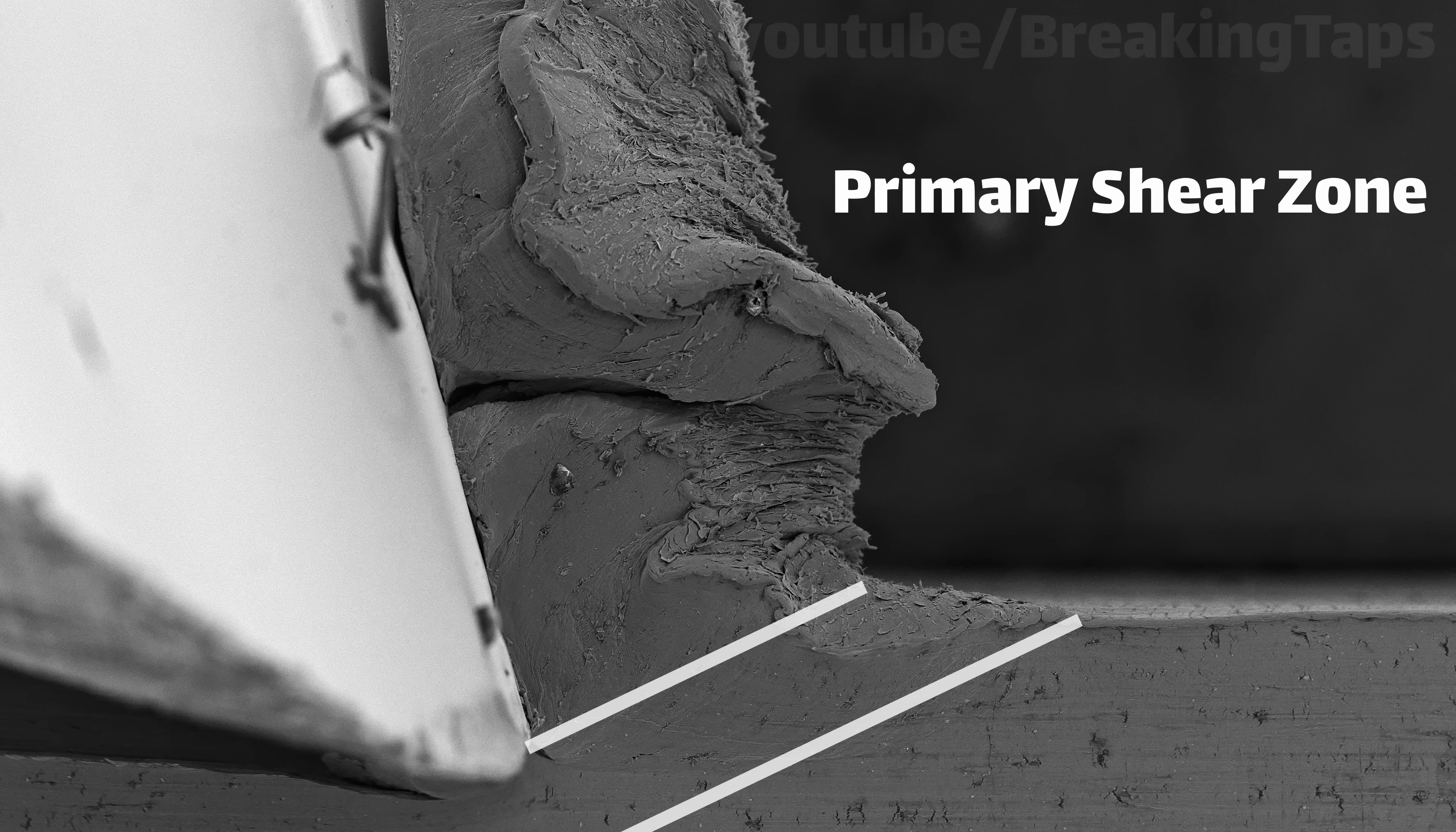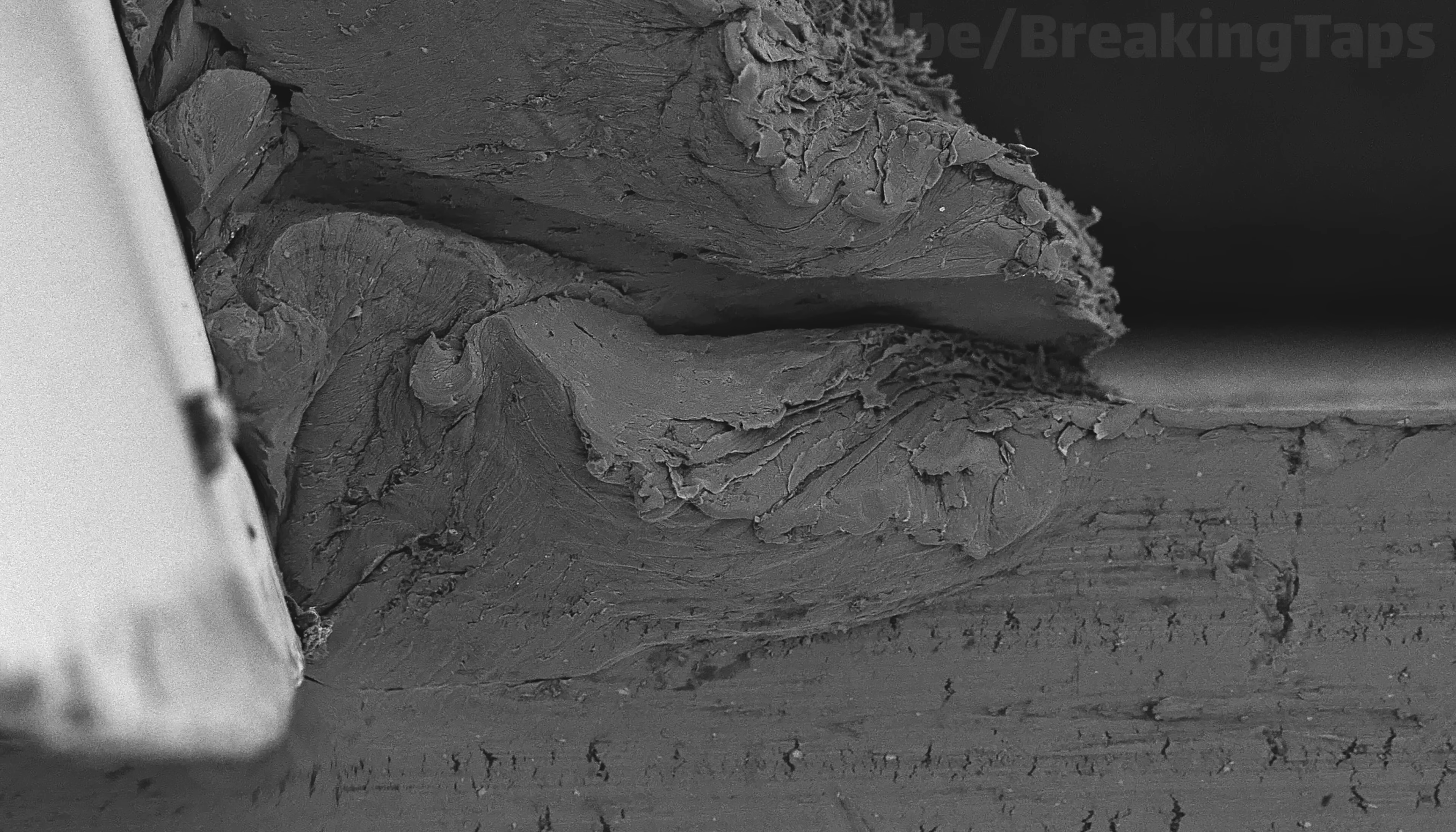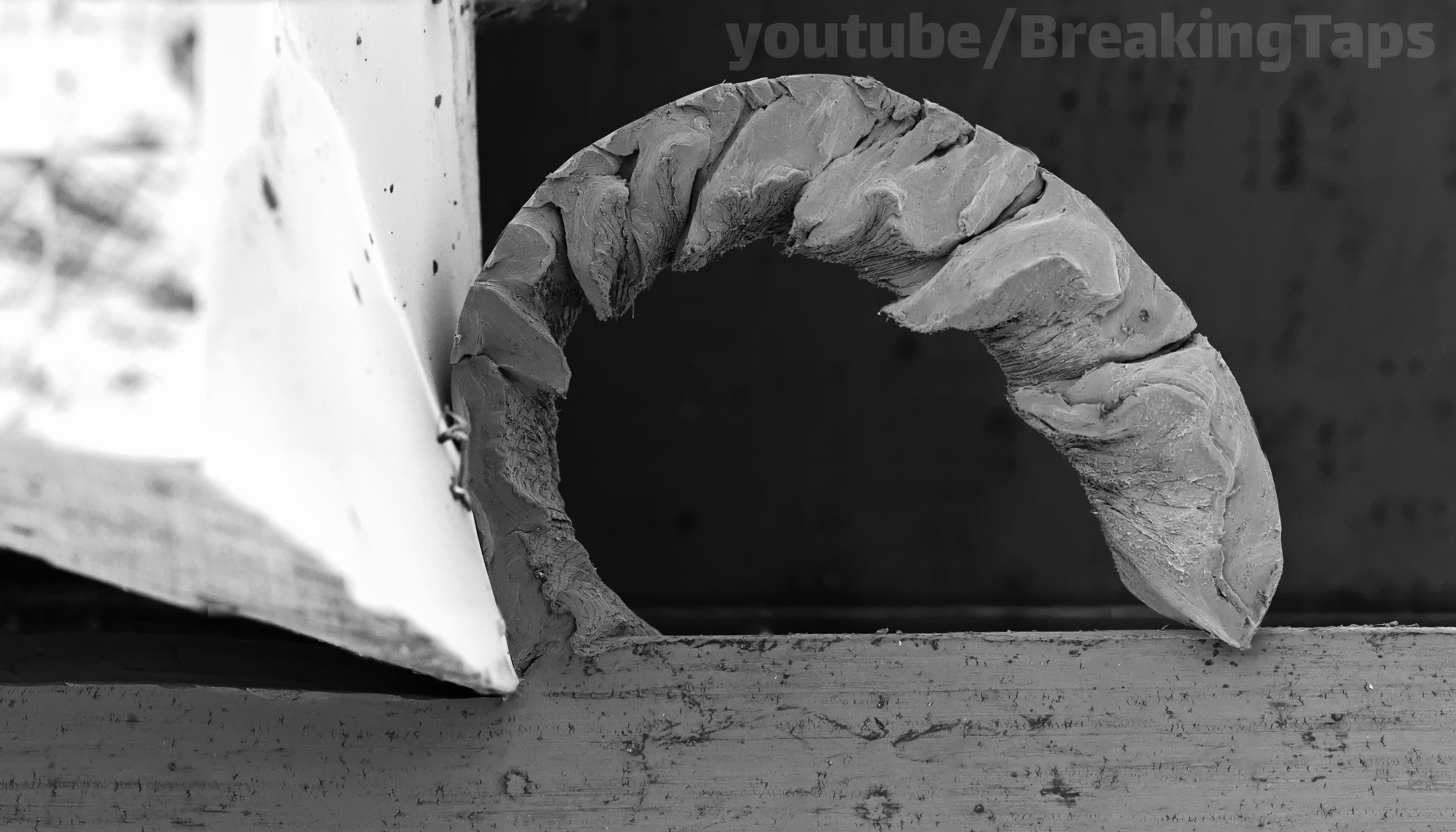The area where this is happening is called the primary shear zone, and it lays in sort of a diagonal to the cutting edge. There's also a secondary shear zone, which is all the metal that gets pushed up against the cutter's face. These areas are of particular importance to researchers because they have altered material properties compared to the bulk metal. As the cutter is moving through the metal, it's displacing and shearing atoms in the lattice of the metal in those two different zones, and so you end up getting different arrangements of the metal after it's been cut. And the way that the shear zones interact with the cutter can be pretty important and change how the cutter performs. As the cut progresses, you can see that the back side where it's being cut gets cleaner and sharper, and then eventually the whole chip starts to curl over itself, which is basically those chip breakers in action.